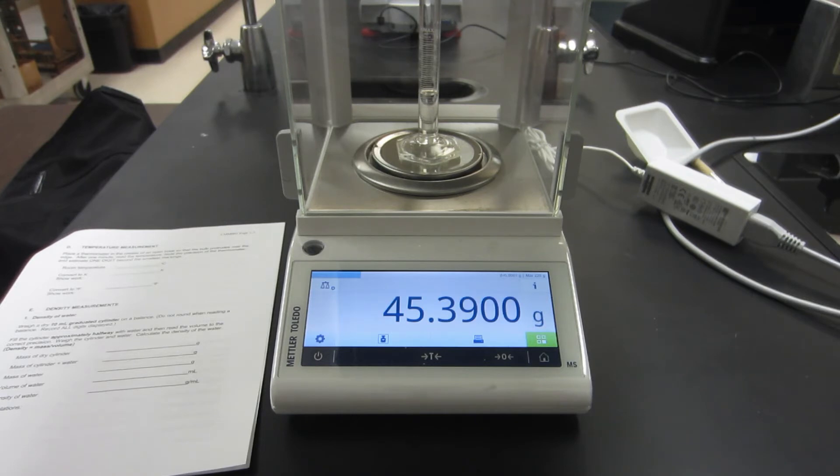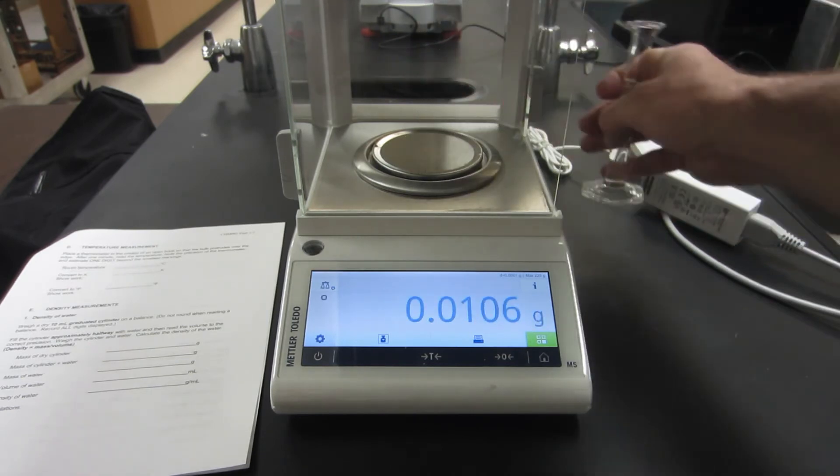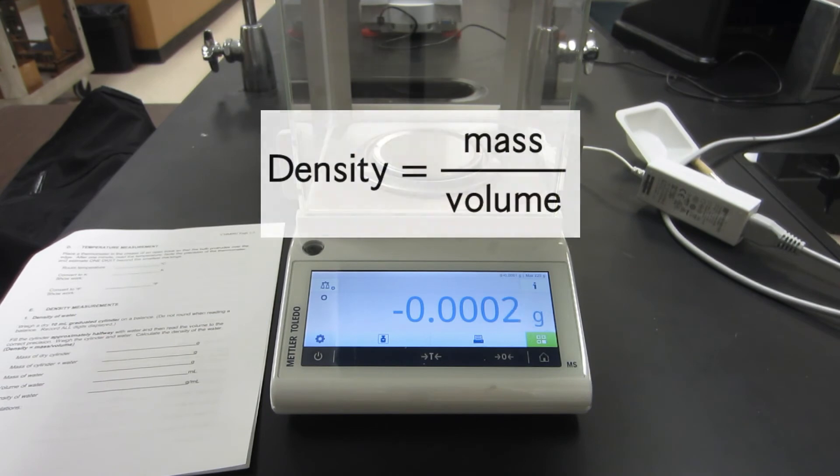There's the mass of the water plus the graduated cylinder, so you can record that on your report sheet. You would subtract the two values to get the mass of the water.